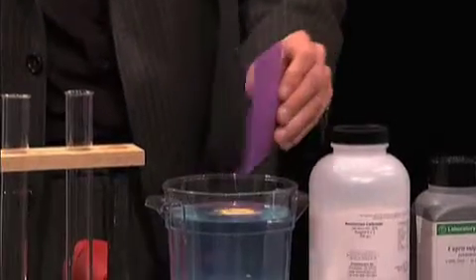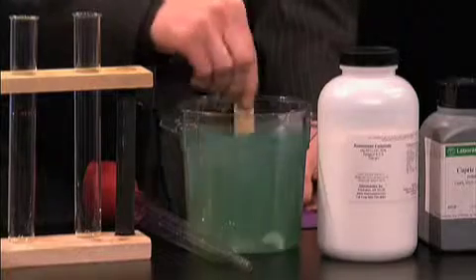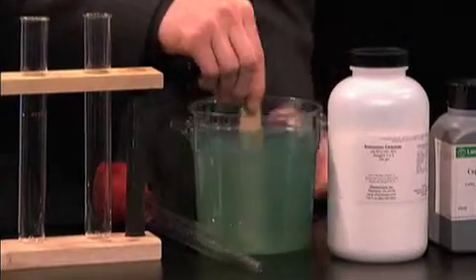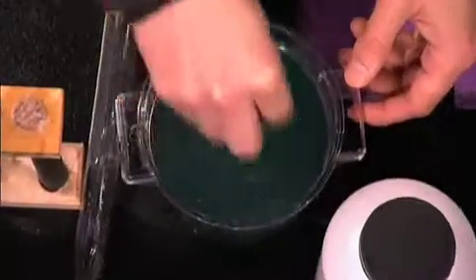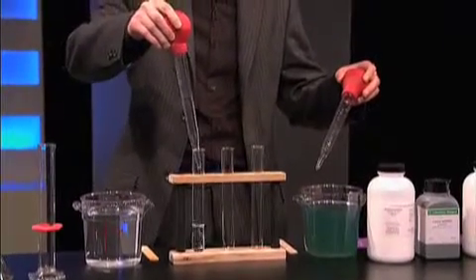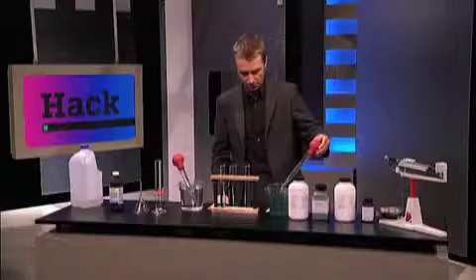All right, so now we dump in the 0.2 grams of luminol, and here we are with a fully prepped solution, just waiting to glow. We'll stir this up. And of course, the final ingredient to this glow party is the ammonium carbonate. That in there. So that's all mixed in and sexy. So next we go back to the hydrogen peroxide solution. Fill that halfway up. We're going to want equal parts. And then back to our luminol solution.